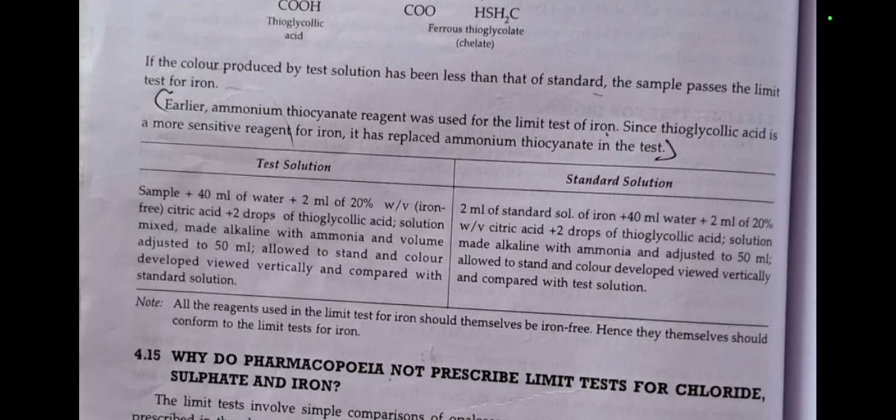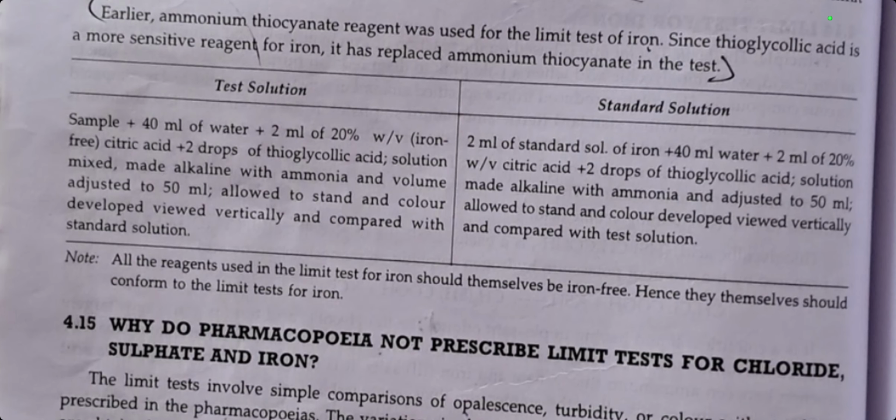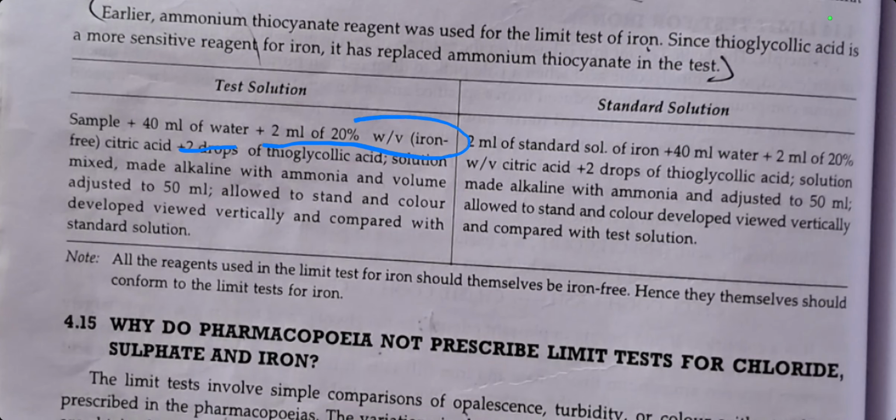Now, how can we perform the test with the standard solution? Let's see. First take two Nessler cylinders labeled as test and standard solution. In the test solution, we add the sample plus 40 ml of water and 2 ml of 20% weight by volume iron-free citric acid and 2 drops of thioglycolic acid solution, made alkaline with ammonia, and the volume is adjusted to 50 ml. Allow to stand, and the color developed is viewed vertically and compared with the standard solution.